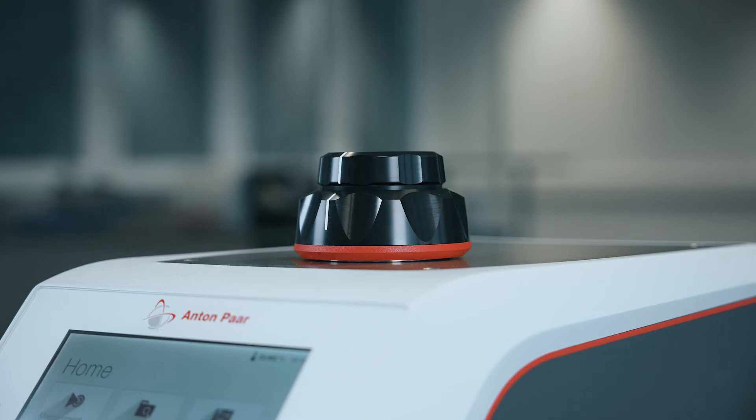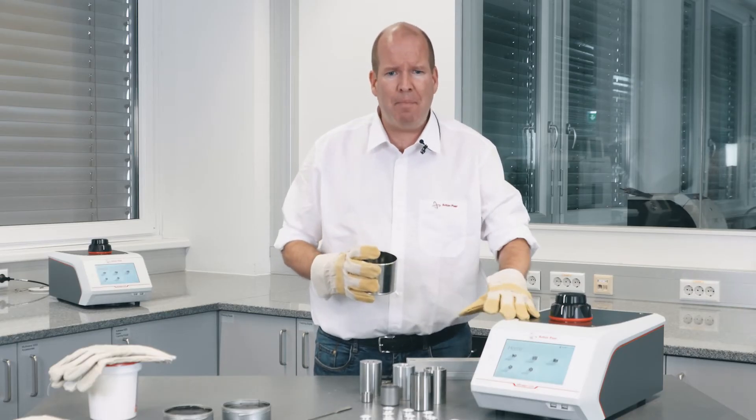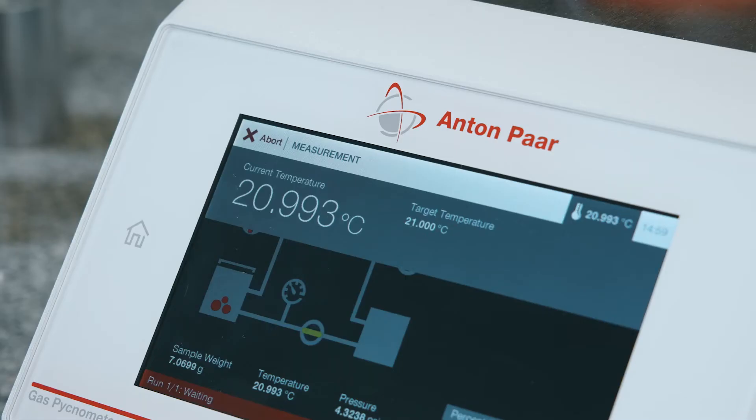Measure the asphalt density at a specific temperature? No problem. The built-in Peltier temperature control offers temperature stability better than plus or minus 0.05 degrees centigrade, with a temperature range from 15 to 50 degrees centigrade — the widest on the market.